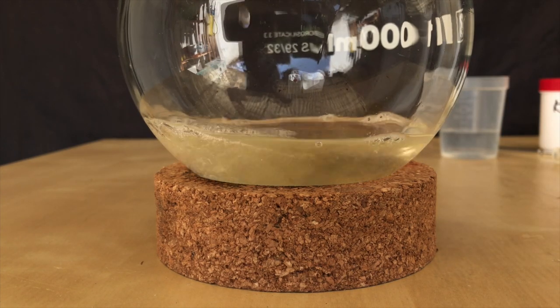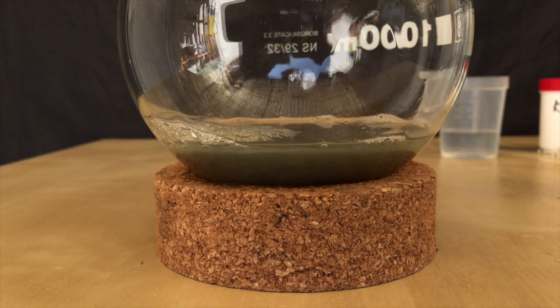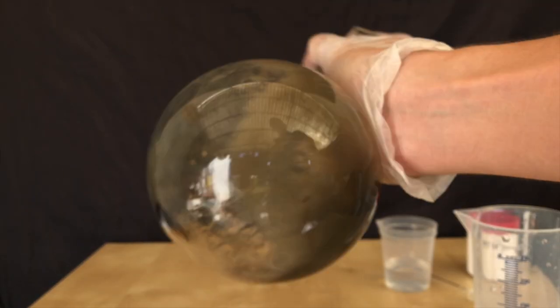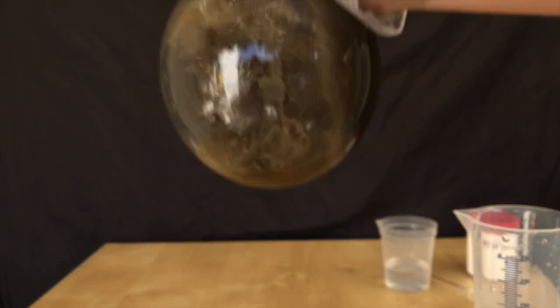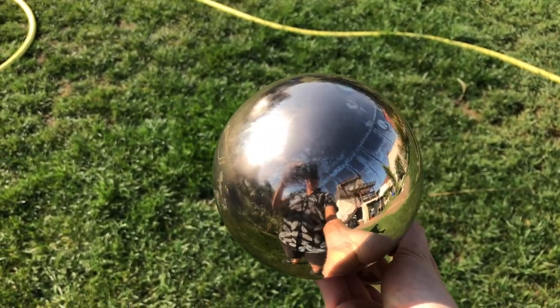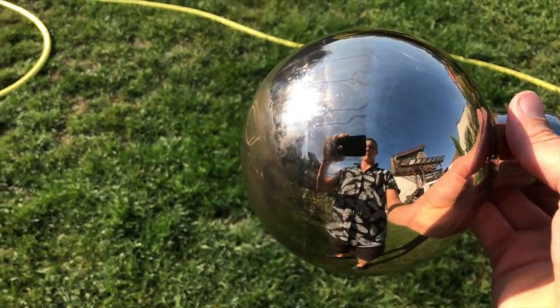Glucose solution was added and we saw this immediate color change. I moved the camera and then shook the flask for about 2 minutes. After rinsing it with distilled water, we didn't get the perfect mirror, but it still looks interesting.